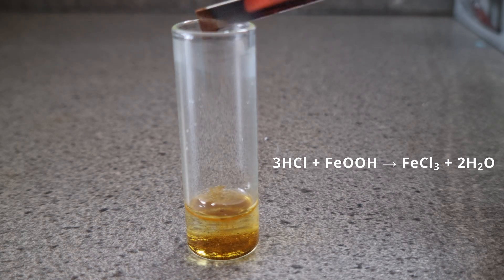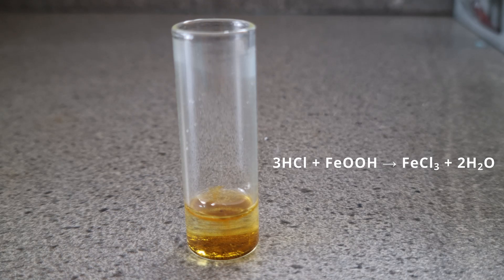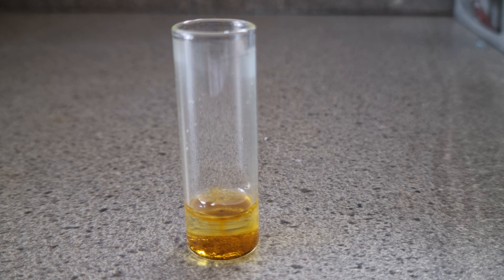We start by adding iron oxyhydroxide to hydrochloric acid. This forms an orange solution which should contain iron 3 chloride.